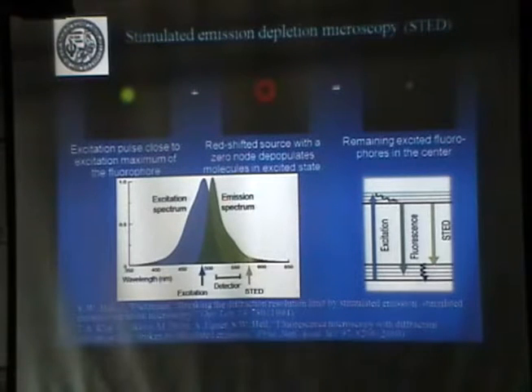Okay, so this is pretty new. He proposed this in the 90s, but it was demonstrated only in the 2000s, in the last decade. And only about this year, or last year, there was a commercially available microscope like this, but people complain it doesn't work. It's tough to make these things work. So we went from a spot size like this to a spot size like this, and now by increasing the intensity of this ring, this can become very, very small.